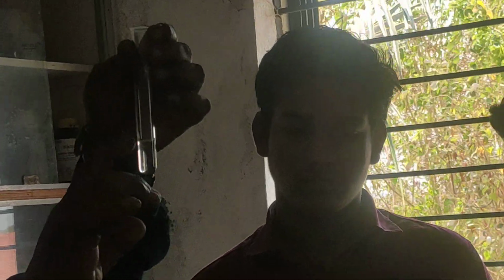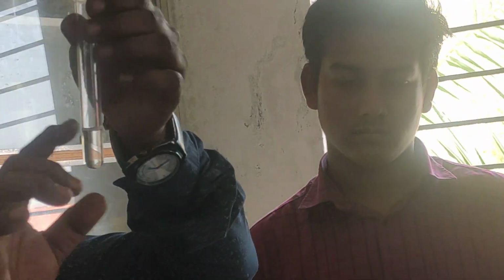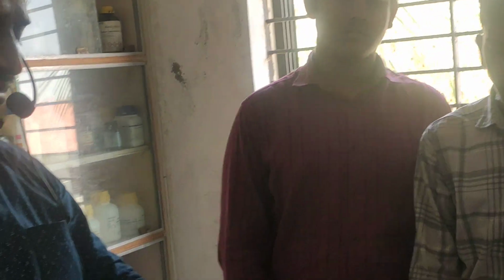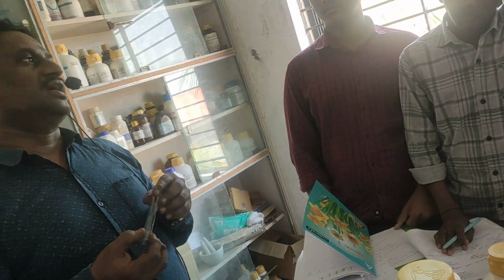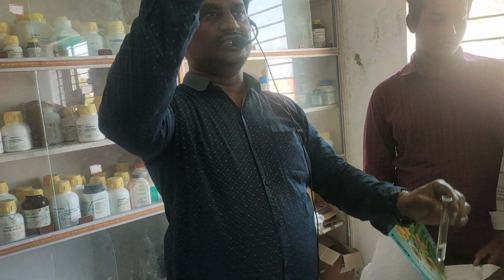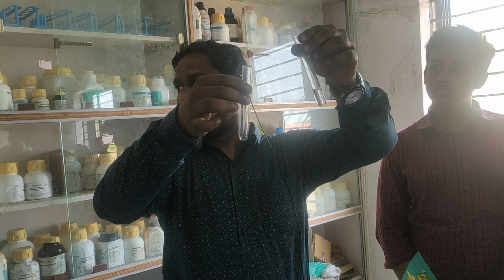We are doing detection for the basic radical, the cation. Keep this original solution on the side. Now we have 6 groups, and in any one group you will get the confirmation. So now I am taking the original solution in a test tube. First, all of you see the original solution.